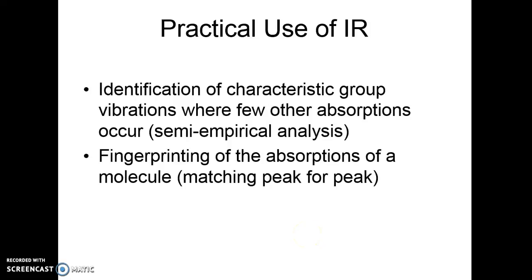In this lab, we're going to be examining a compound that you make with infrared spectroscopy and using the information from the infrared spectroscopy to identify the compound. The way that we can identify a compound is through its functional group.